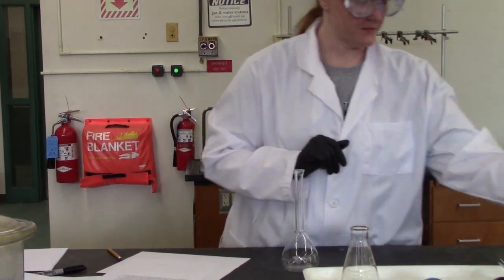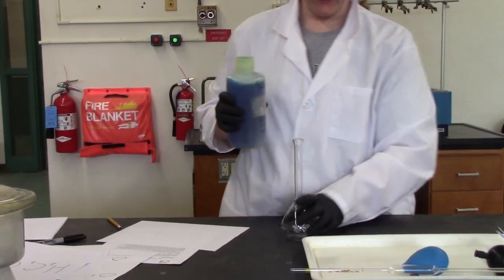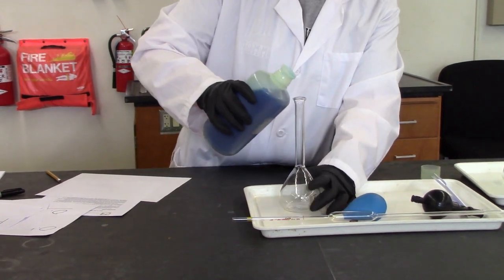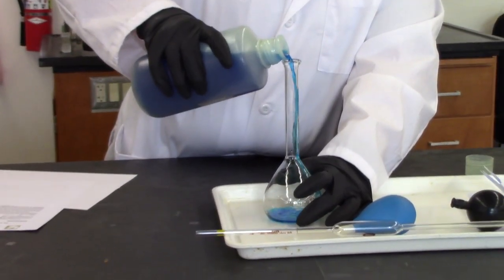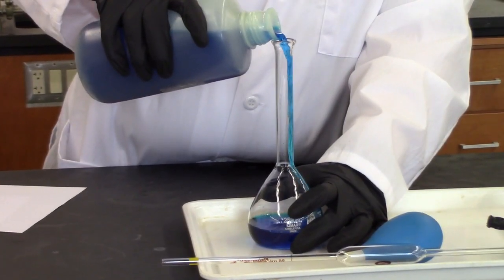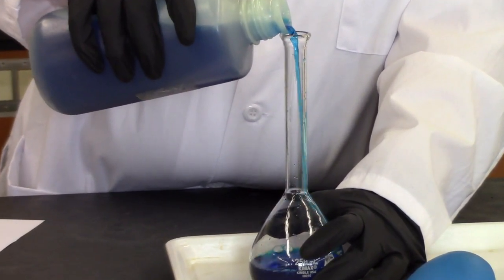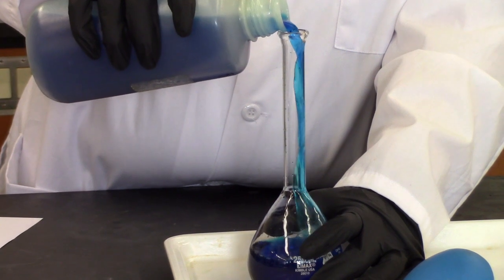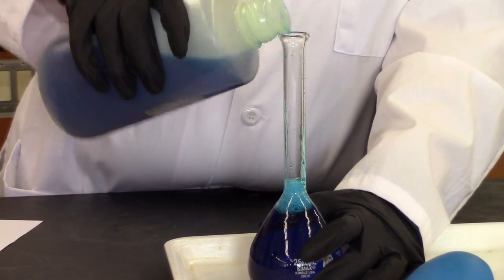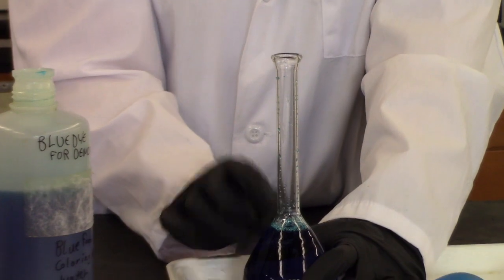All right. So what I'm going to do is simulate this with a colored dye so you can see a little bit better, all right? You don't need to use a funnel. That's just going to cause more transfer loss, all right? We want to minimize the amount of stuff that touches our oxalic acid. So all you do is put the two containers together like so and pour slowly and it'll be fine. Now yours is not going to be blue. Again, I dyed this just so that you could visualize what's happening better. Yours won't be as bubbly either. The dye does that. Okay?